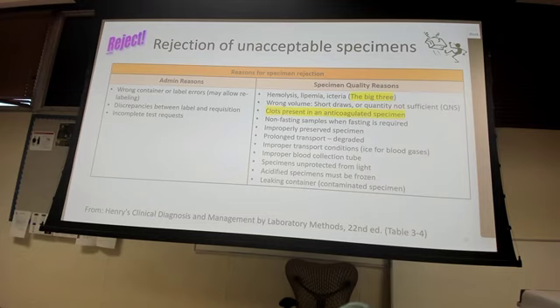But anyway, so rejection of unacceptable specimens. We don't like to reject specimens, but we do if you do not send it to us correctly, okay? So make sure administratively that it's labeled correctly, the requisition meets what's on the label, and that the request is completed in the system, okay?